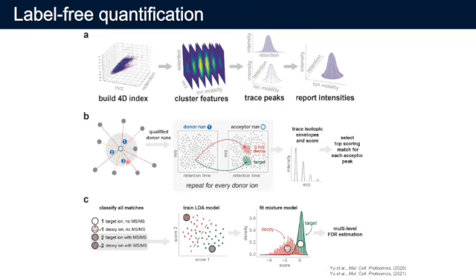And given a run that is going to accept the transferred peptides, IonQuant will calculate the correlations against all the other runs, and then it picks the highly correlated runs as donor runs. For each donor run, it will transfer the peptides to the acceptor run based on their retention time, mass to charge ratio, and ion mobility if the data is from DDA PASEF.